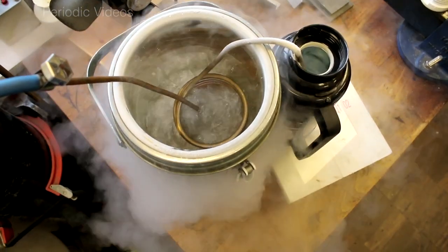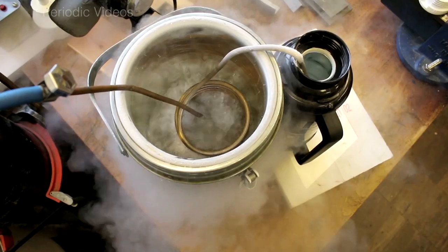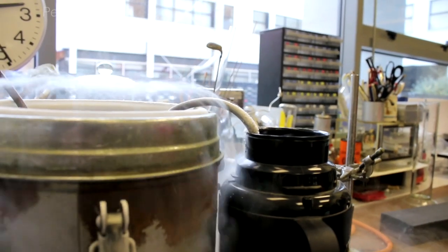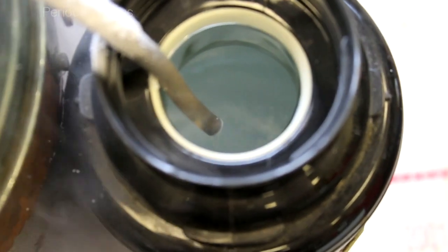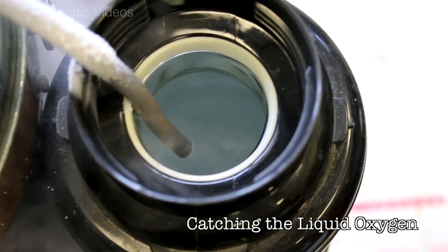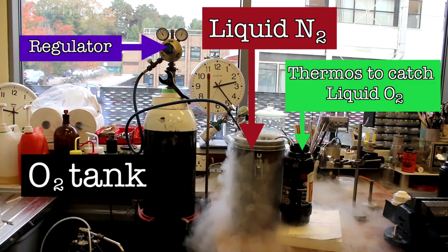In the coil, it liquefies, and when it liquefies, the flowing gas blows through probably droplets or slugs of liquid out of the other side, and then it's fast enough so that it doesn't all boil away when it goes through the last piece of tube, and then it goes into a thermos flask.